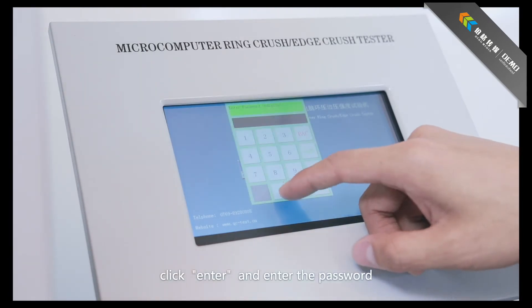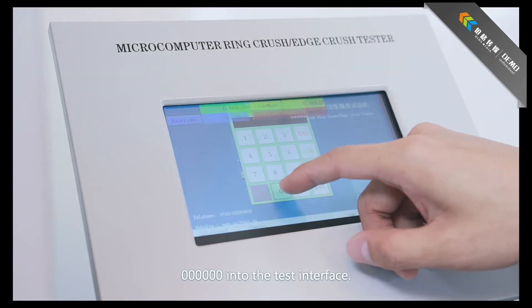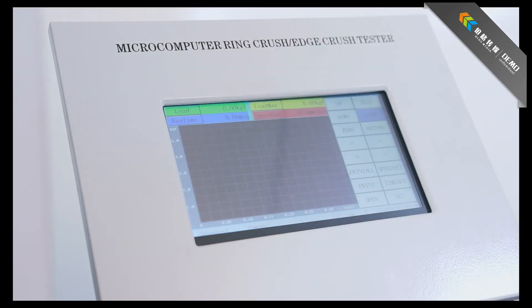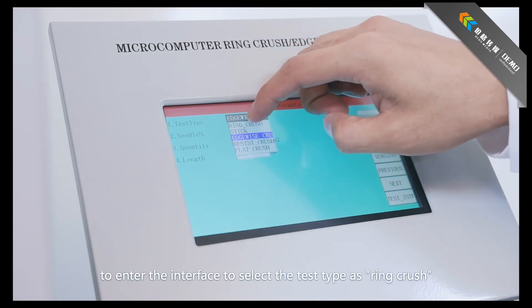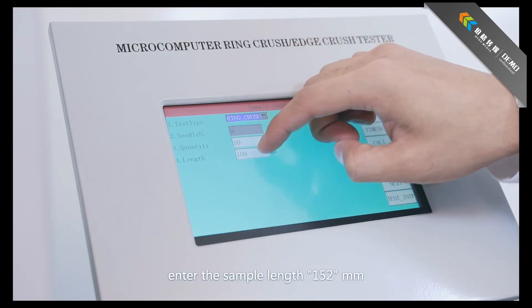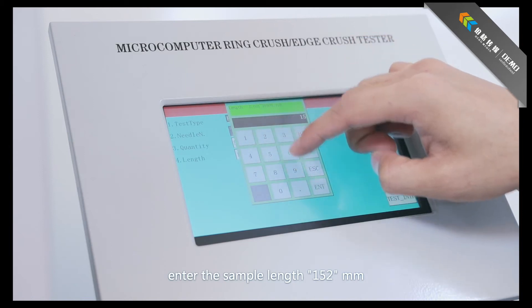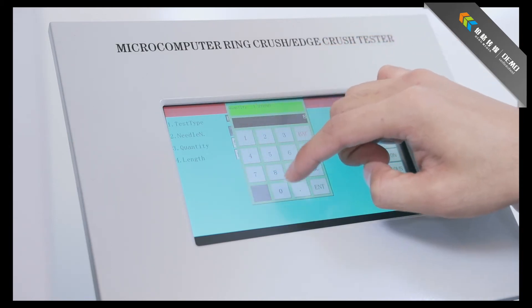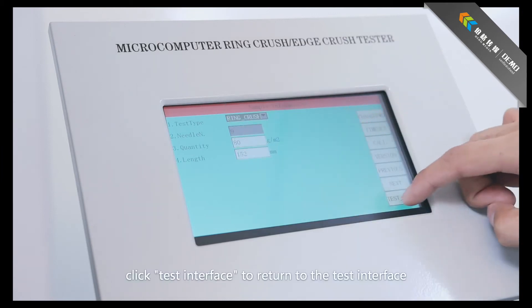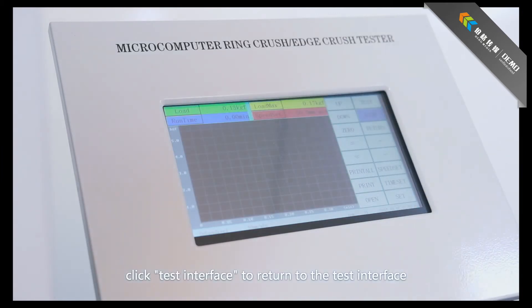Click Enter and input the password — six zeros — to enter the test interface. Click Set to enter the settings interface and select the test type as Ring Crush. Enter the sample length of 152 mm and the sample qualitative value. Click Test Interface to return to the test interface.